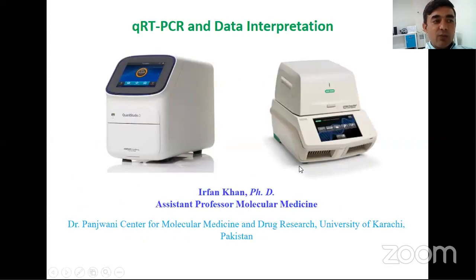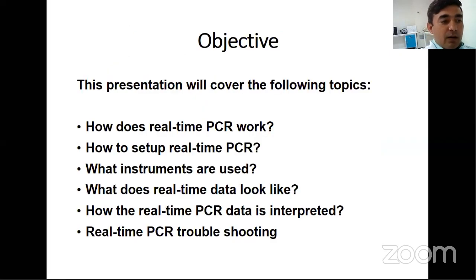I will start my presentation with qPCR and qPCR data interpretation. The objective of this talk is how real-time PCR works, how the real-time PCR setup is performed on the machines, which type of instruments we are using for real-time PCR, how the real-time PCR data looks, how it is interpreted for the process of COVID diagnosis, and finally we will talk about some troubleshooting in real-time PCR.